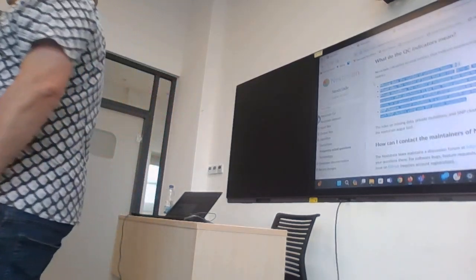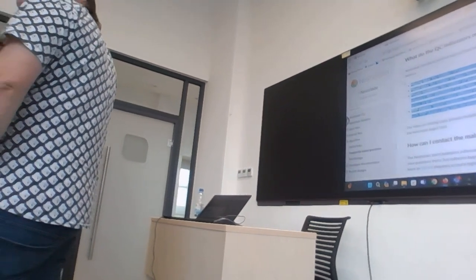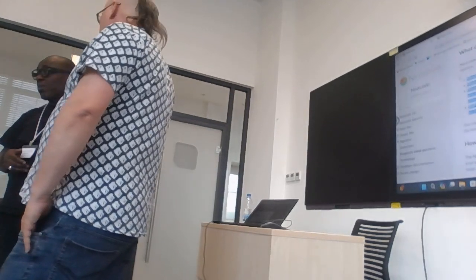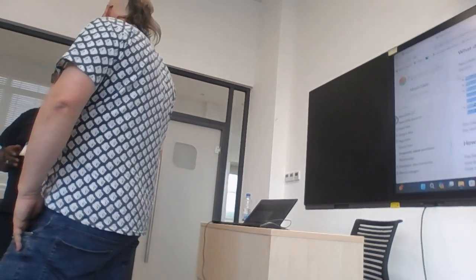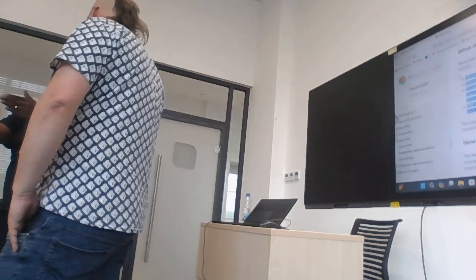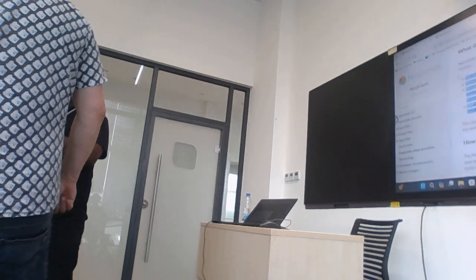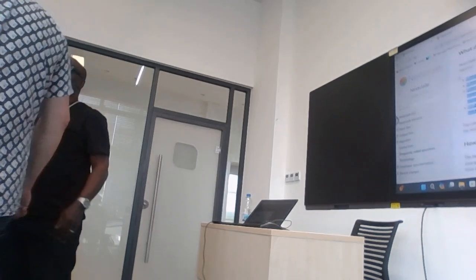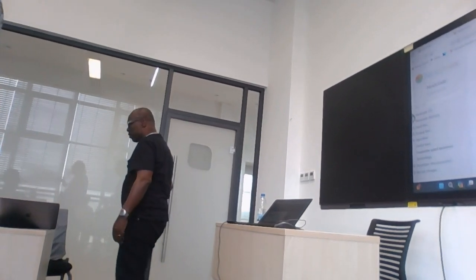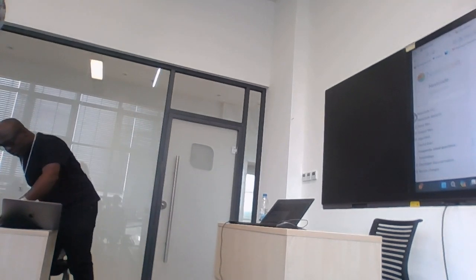When we align to a reference sequence, how many mutations do you expect to say that we are in another clade? In another clade, it's lots. I'll get the numbers by tomorrow. I'll look it up overnight.